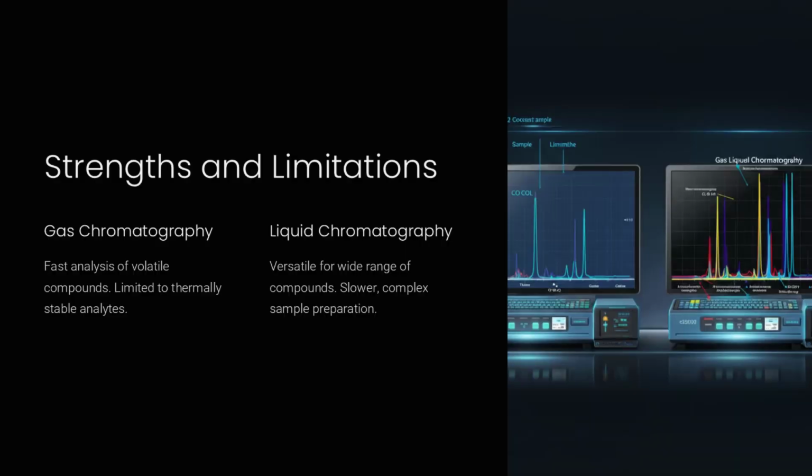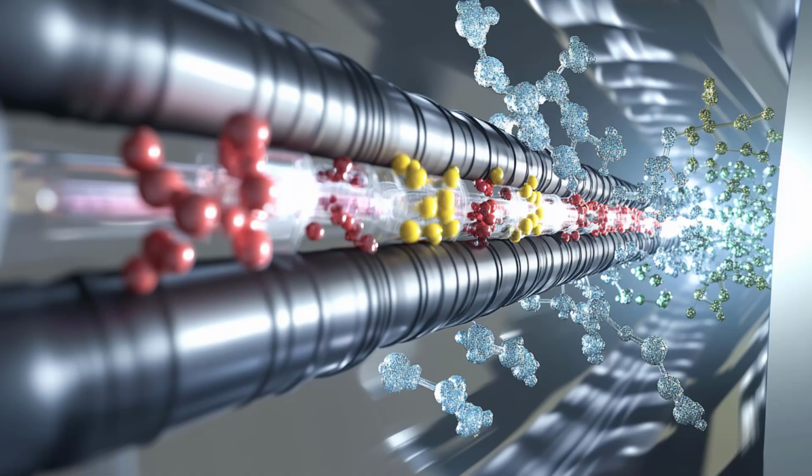Gas chromatography is highly effective for volatile compounds, offering fast analysis and high resolution, but is unsuitable for non-volatile or thermally unstable analytes. Liquid chromatography is versatile and capable of analyzing a wide range of compounds, but is slower and requires more complex sample preparation compared to GC.